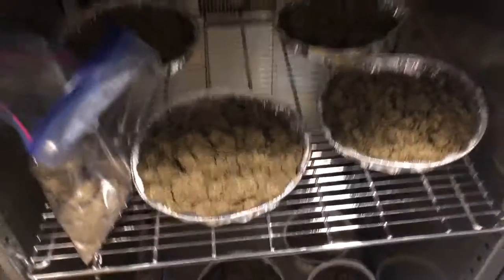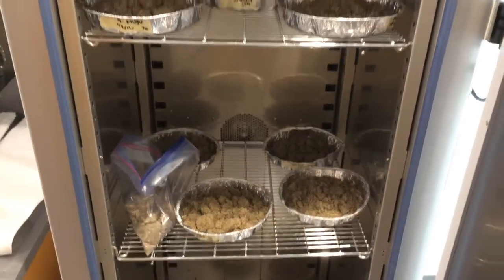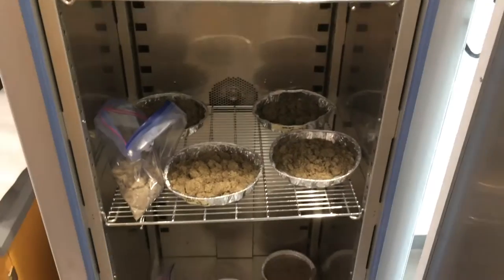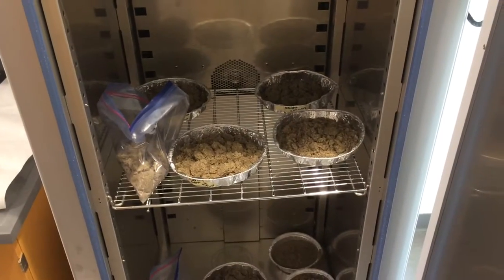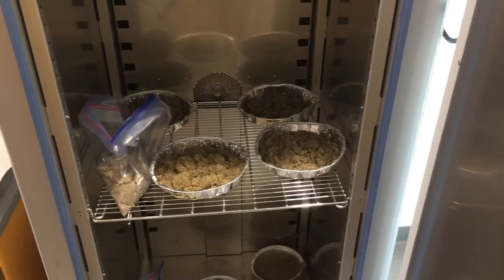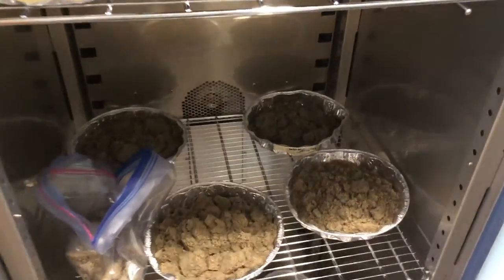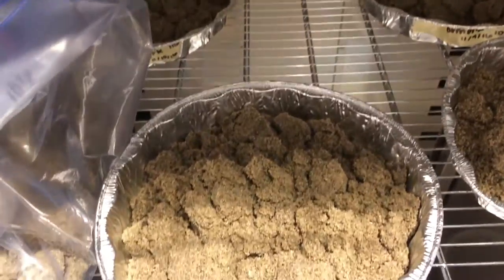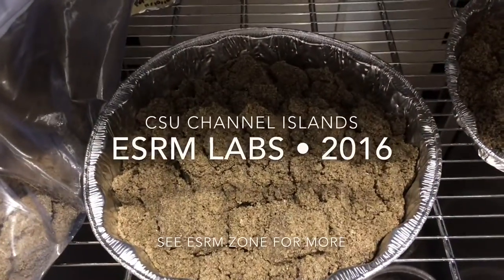Also, these samples should go in here mostly dry already — at least air-dried — so they're not sopping wet, because that'll make the drying oven have to work even hotter. So that's the best way to set our drying ovens up to dry sand for microplastics or sediment grain size analysis, or anything else we're doing with our setup. Thank you.